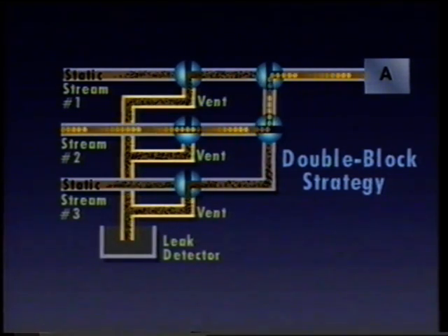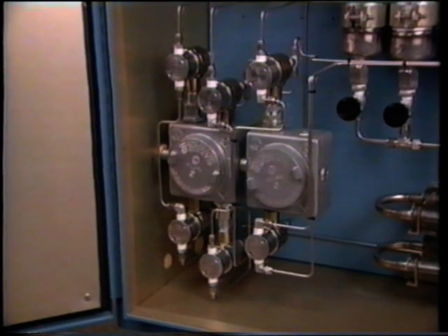The most important maintenance consideration for a block and bleed arrangement is to prevent contamination. Contamination can result when the blocked valves diverting flow of unwanted streams leak into the analysis stream, invalidating the sample. Contamination is a common cause of failure for both electric and pneumatic stream switching valves. If the valves malfunction, clean and replace as necessary.